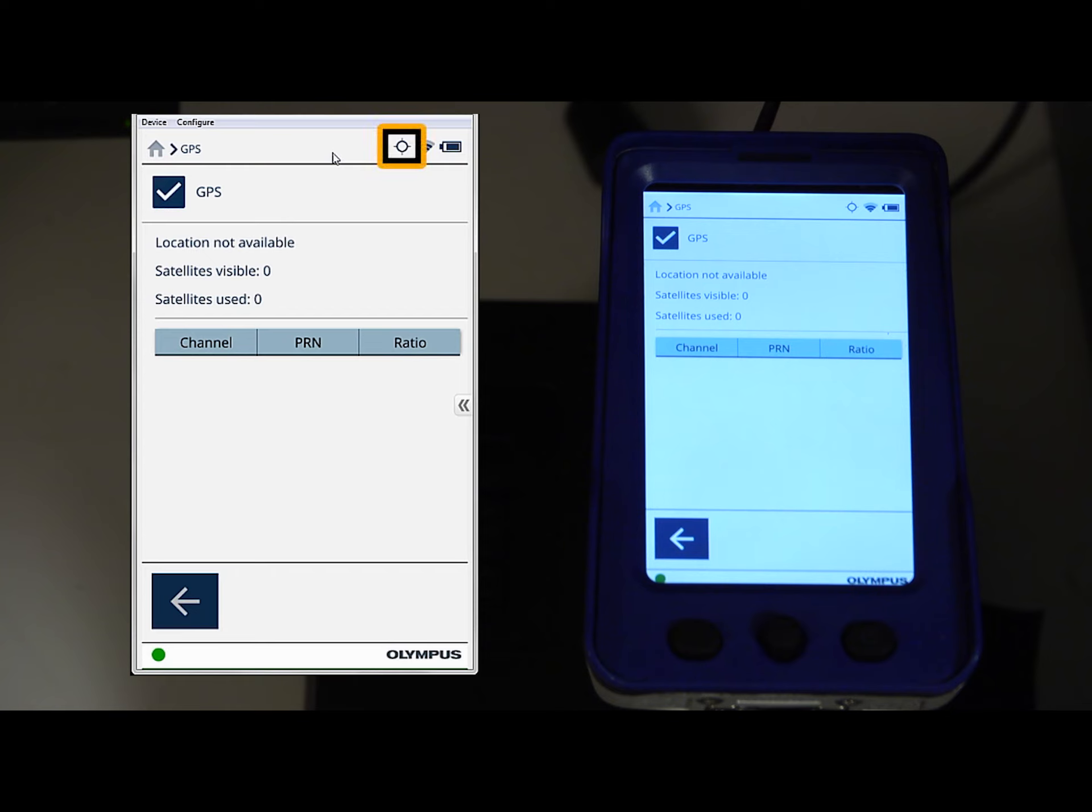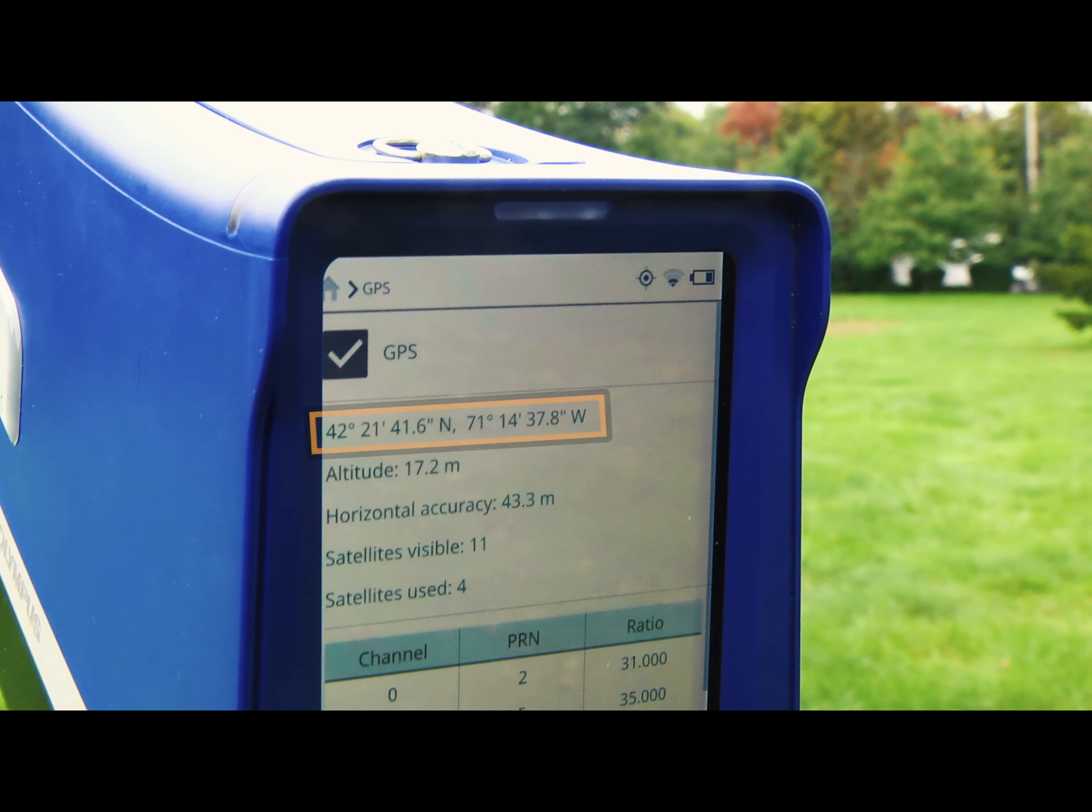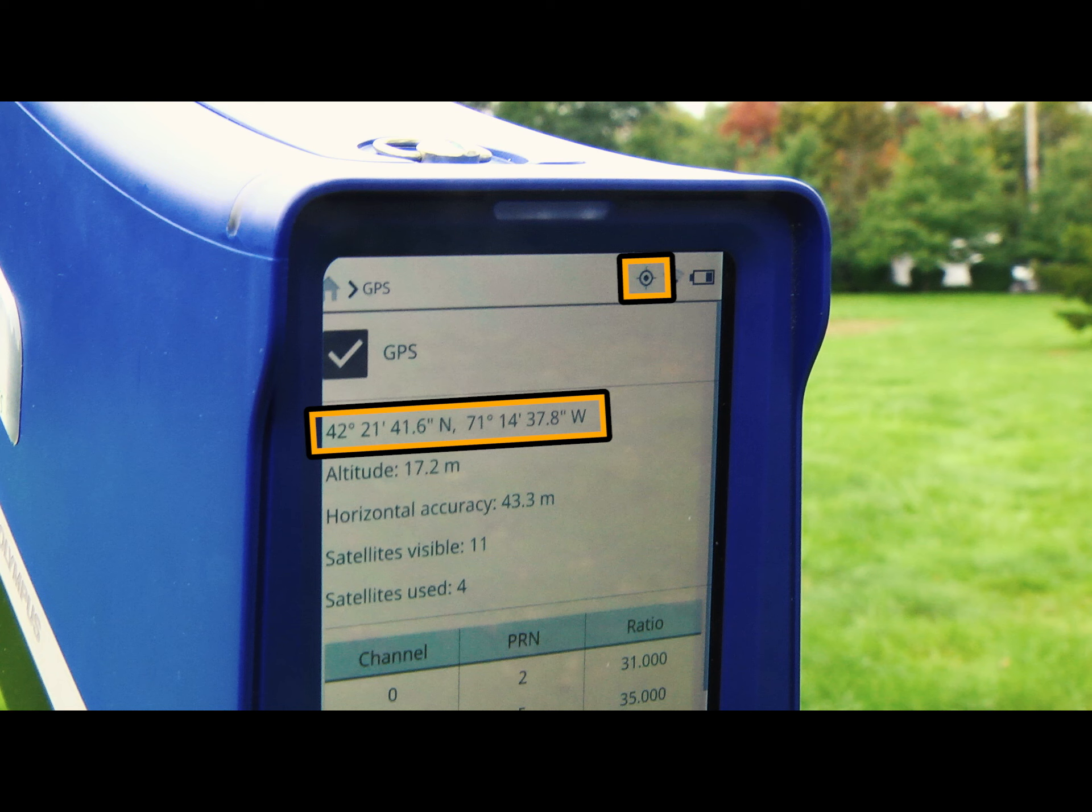You'll also notice that the circular icon appears in the upper right-hand corner. Once your location has been established, the coordinates will appear across the top of the screen, and that open circle in the upper right-hand corner will fill, indicating that GPS is on, functioning, and ready to use for testing.